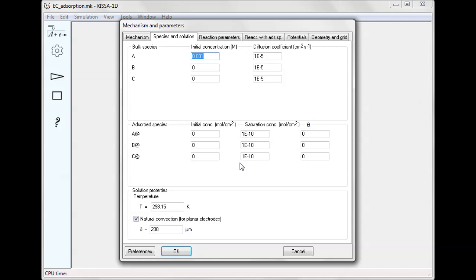Initial concentrations can be set either as absolute concentrations or as relative surface coverages. In this case, initial concentrations are zero, but they reach their nearly equilibrium values while the electrode is held in the solution for 50 seconds at its rest potential before the voltammetric scan.